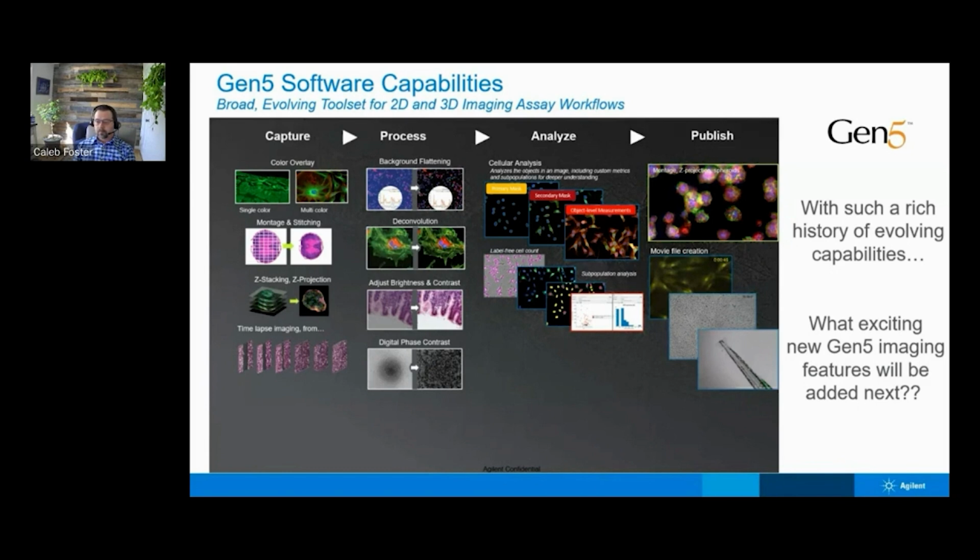What are the most significant current image analysis challenges? That's a great question. If you look at image analysis, it was really built around fluorescent imaging, and in fluorescent imaging it's easy to separate cells from the very dark background. I think one of the biggest challenges today in image analysis is the strong move towards more label-free and unperturbed cells.